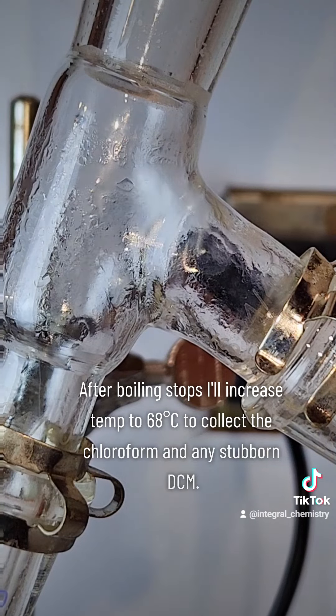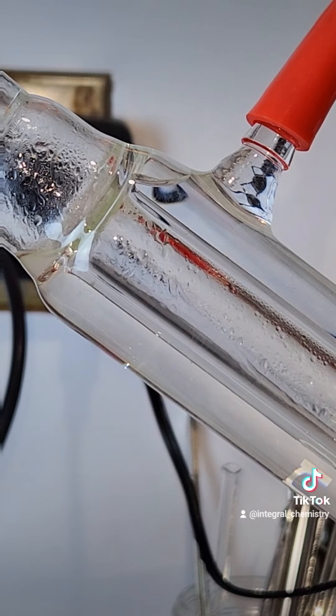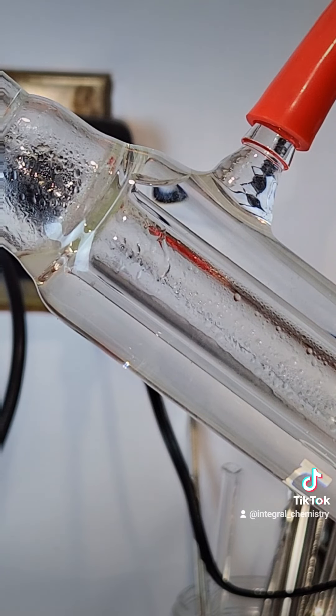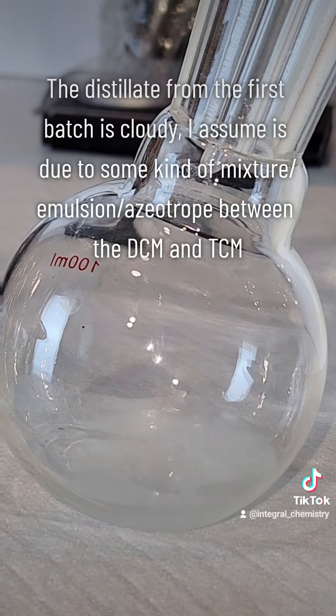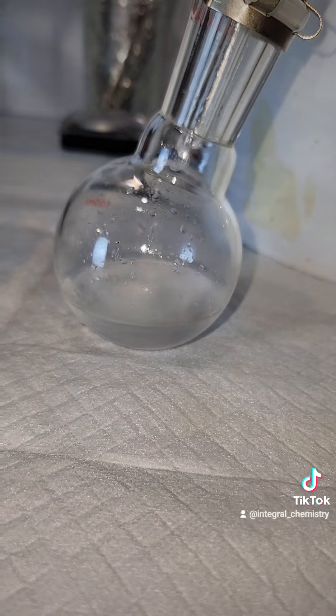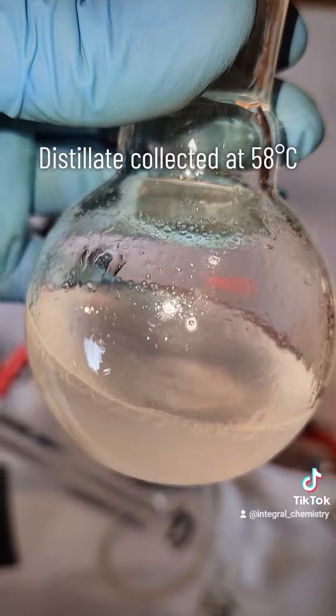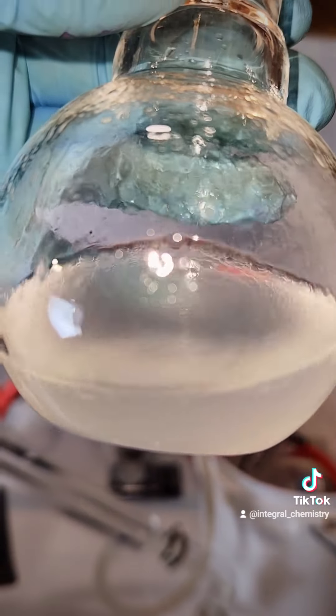At that point, I'll replace my collection flask and boil at 68 degrees Celsius, which should distill over all the chloroform while leaving the ethanol behind. You can see here my distillate that came over below 58°C is kind of cloudy, and I believe that's due to some sort of mixture or emulsion between the DCM and the chloroform. This isn't a problem, though, and I'll be removing it in the next step.